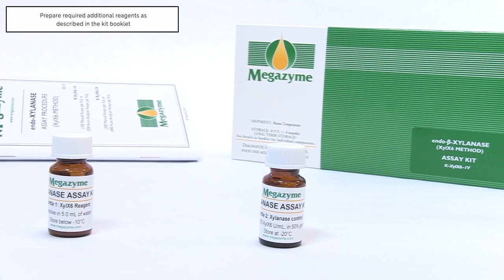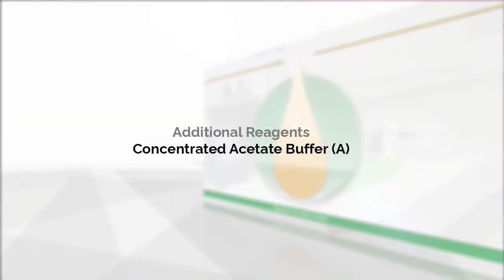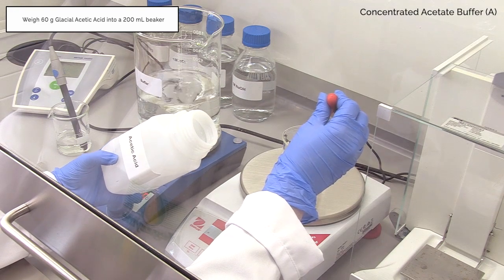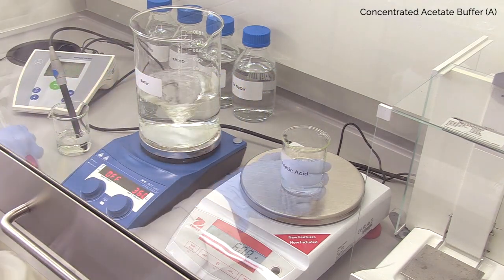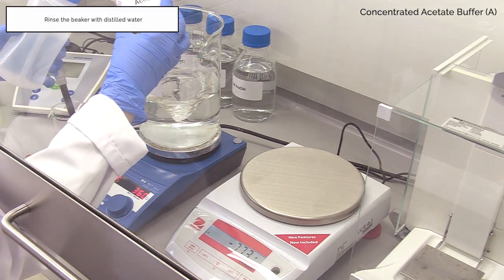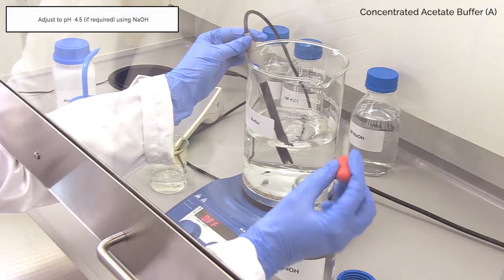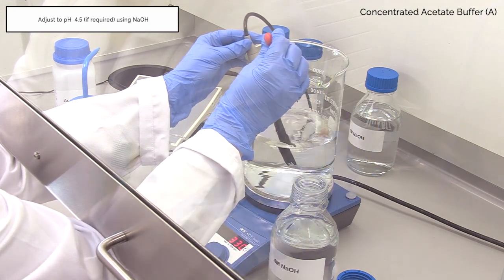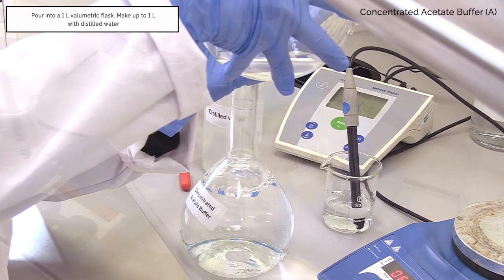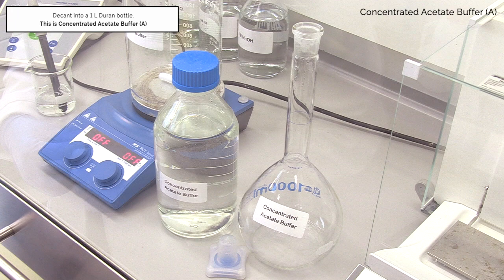Prior to sample analysis, prepare the required additional reagents as described in the kit data booklet. Weigh 60 g of glacial acetic acid into a 200 ml beaker, then add this to a stirring beaker of 800 ml of distilled water marked buffer. Wash the original beaker into the 800 ml of distilled water using a wash bottle. Adjust the pH to 4.5 using 4 M NaOH. Pour into a 1 litre volumetric flask and make up to 1 litre using distilled water. Decant into a 1 litre Duran bottle. This is concentrated acetate buffer A.